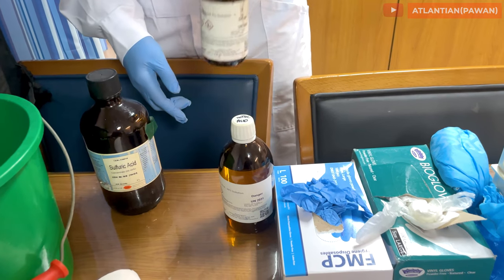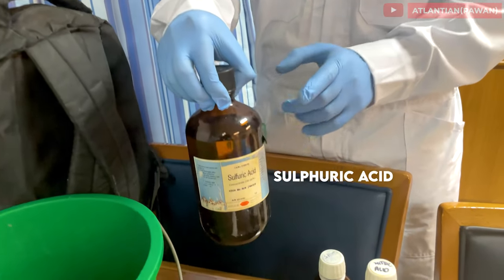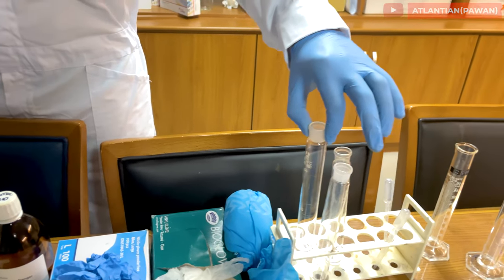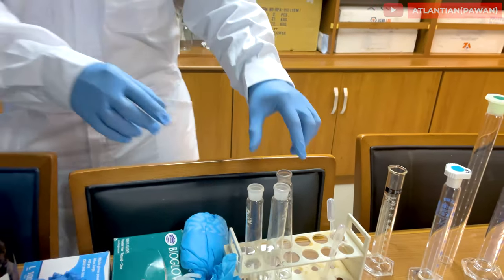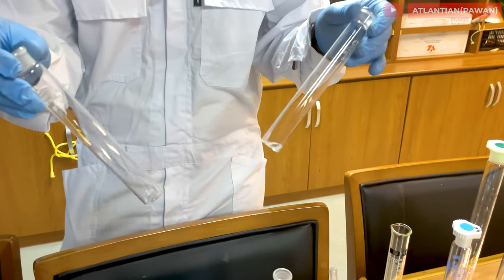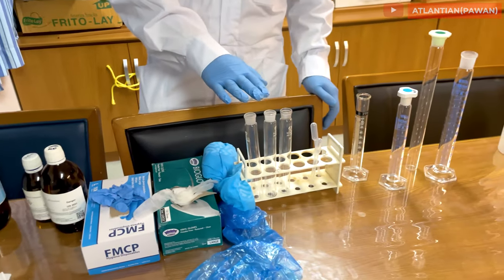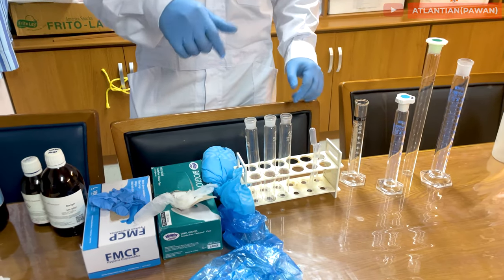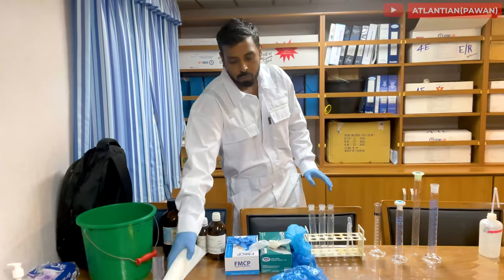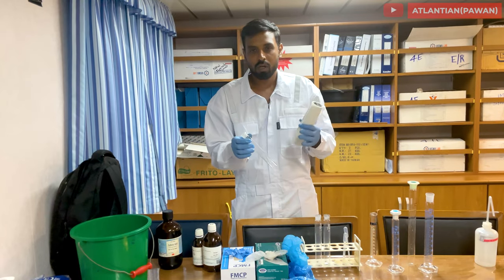I also have one bottle of sulfuric acid. This is required to clean your test tubes or sample bottles if they have discoloration — pink, yellow — or if you doubt they are not cleaned properly. You can add a few drops of sulfuric acid into your bottles, then rinse properly with DI water and discard in your waste bucket. You can also have tissue papers with you to wipe your bottles as required.